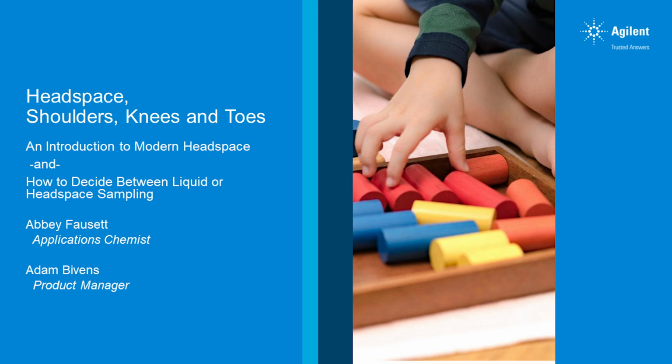Today, we're going to be covering Headspace shoulders, knees, and toes, an introduction to modern Headspace technology, as well as covering the topic of how to decide between liquid or Headspace sampling with current technologies today. So without further ado, let's get started.